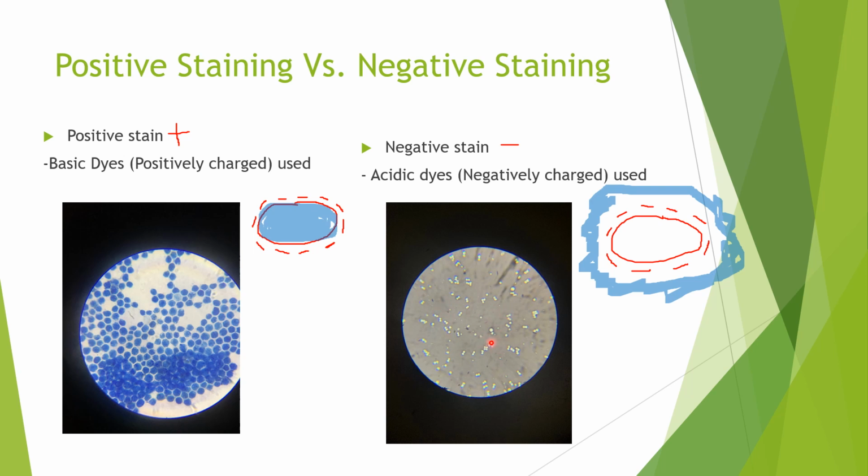And notice how the bacteria is shining and illuminating. That's because there's a huge contrast. Because the bacteria is not stained, it's going to appear like it's fluorescing, even though we didn't use any fluorescent dye. It gives you an impression that it's fluorescing against that dark background.